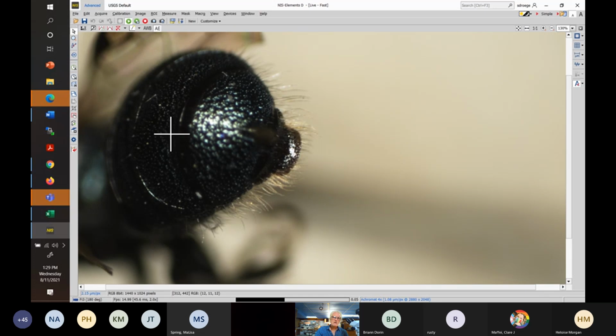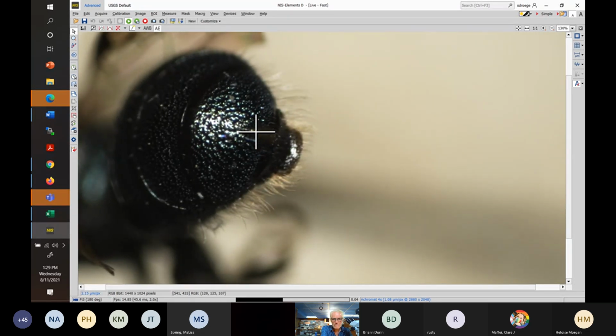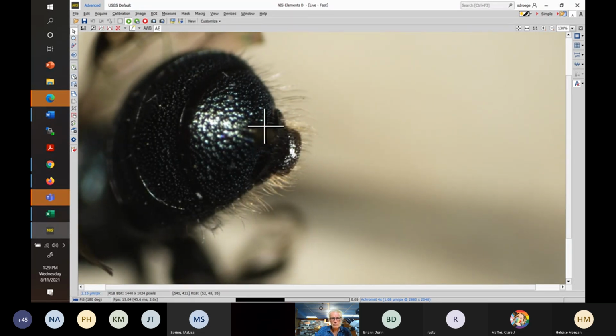Here's the abdomen. This is that tuft of hairs, roughly right there. Not visible, but also not that useful. This is the flange. So this is a projecting, shelf-like, thin flange. All the species have this. When you're looking at Calcarata, note it's very wide compared to its height here.